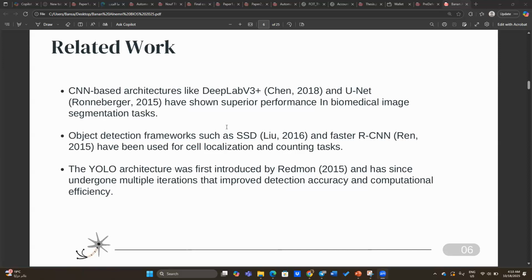The need for accurate, scalable, and repeatable quantification of cellular features has driven the growth of the field of automated cell analysis research. Cellular structures have historically been segmented and measured using conventional image processing methods like thresholding, watershed segmentation, and morphological filtering. However, these techniques frequently have difficulties with complicated biological images, which result in inconsistent segmentation outcomes.